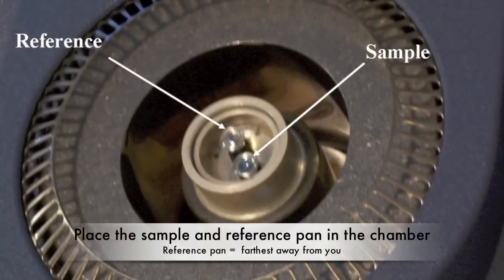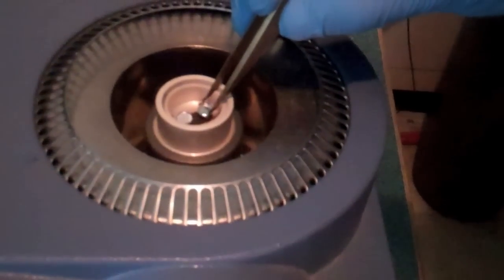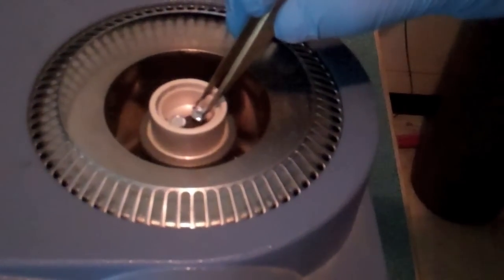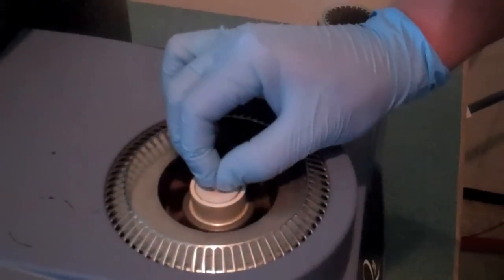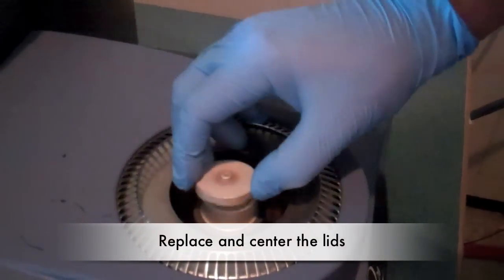There are two pan positions inside the chamber, one for the reference pan and one for the sample pan. Using the tweezers, place the reference pan in the position that is farthest away and the sample pan closer to you. Replace the inner lid, making sure it is centered. Then add the middle and the top lid.